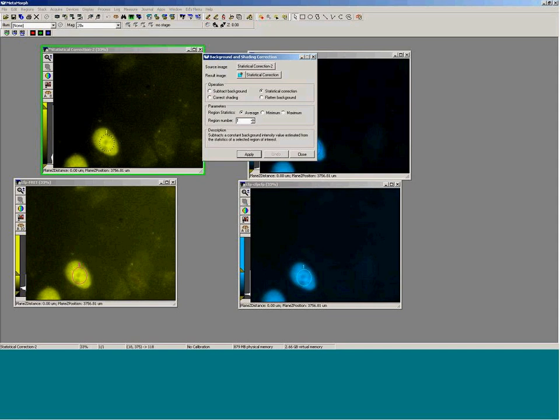If I move the decimal place over one value, the way to interpret these results is that I'm looking at a 37.5% FRET efficiency, 29.4, 36.8, 34.3, 30.2. If I look at the average intensity within this, that's a 33.6% average FRET efficiency calculation.